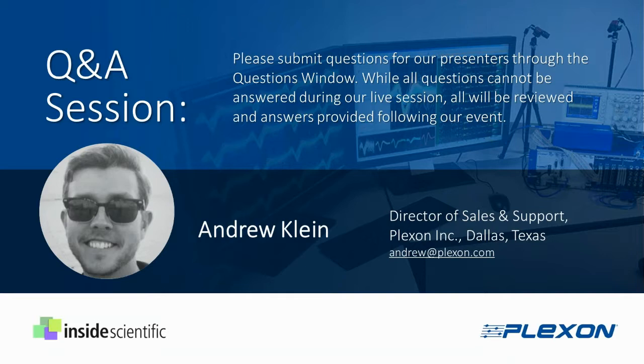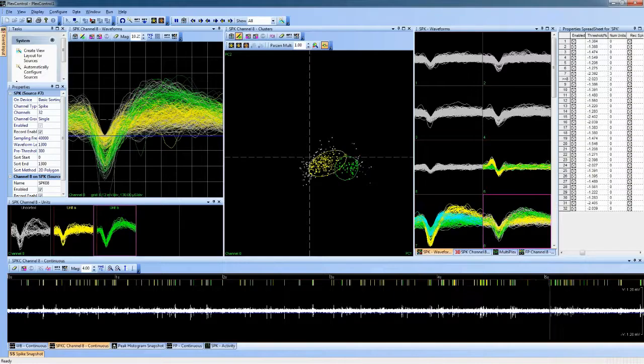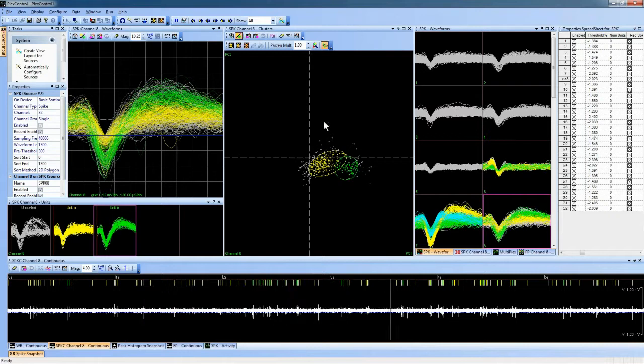First question for you is, when using 2D polygon sorting, how does the system determine which unit to assign a waveform to if the waveform is plotted in 2 or more overlapping contours? Thanks, Annie. Yeah, that's a good question. I think the best way to demonstrate that would be just to go right back into the software here. If I come back into Plex Control, there's an example right here of 2 overlapping 2D polygons.